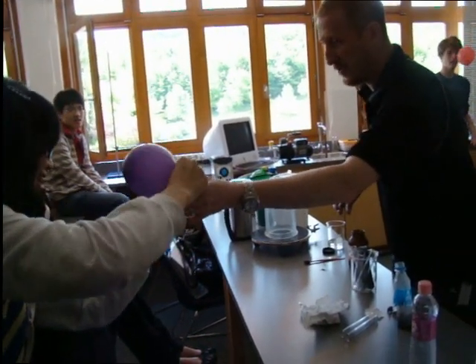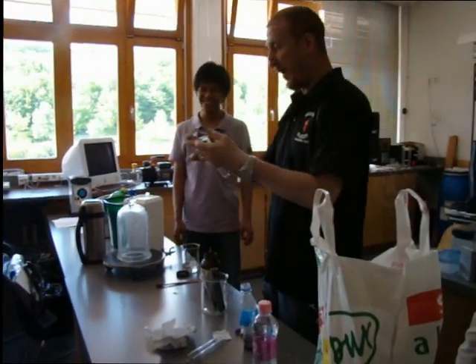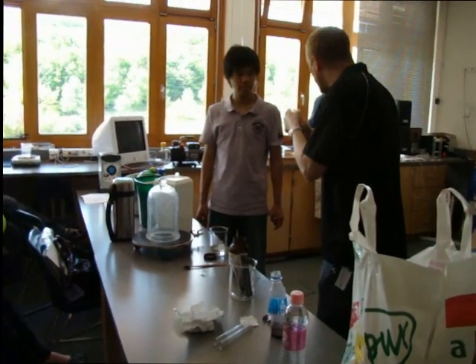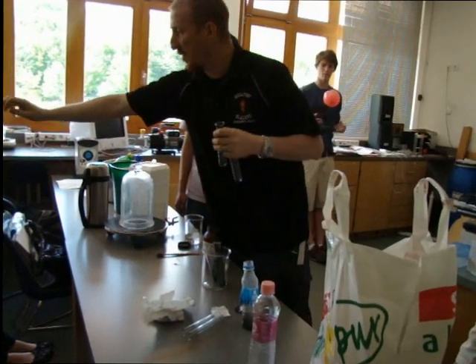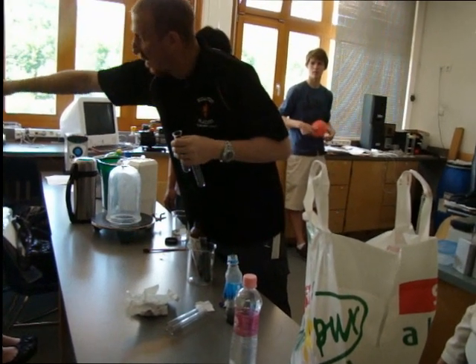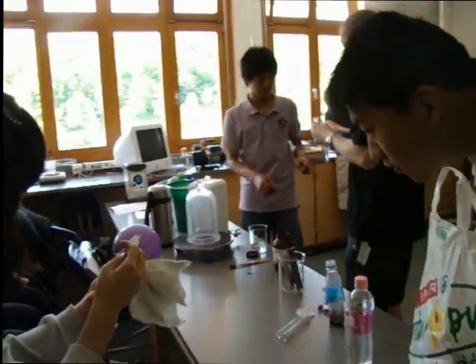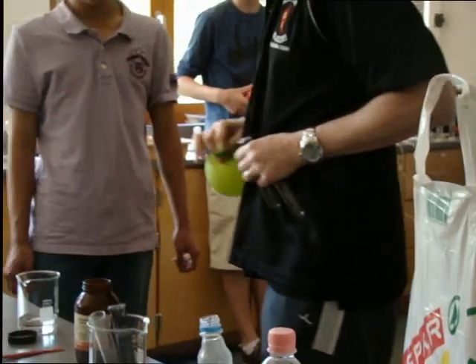We'll do this first so we don't have to hold it. Okay, now the tricky part — we gotta put those balloons on here. Oh, it's leaking. It's not going to cure oxygen. It's okay. That was water.